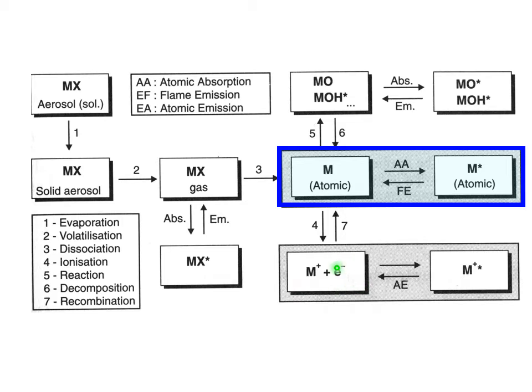We can suppress ionization by adding electrons to our mixture. How can we do that? We can add other elements, say potassium, that will make ions and electrons, and these electrons will react with our sodium ions, making sodium atoms again.